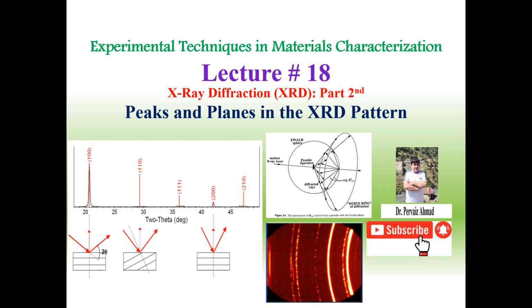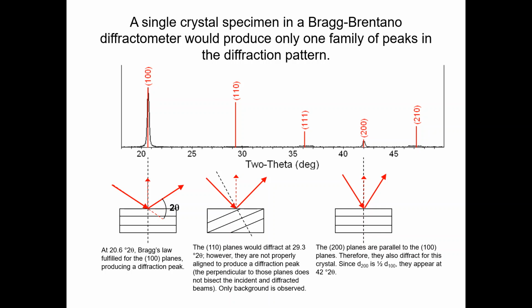Students, welcome to Experimental Techniques and Material Characterizations, lecture number 18. I'm Dr. Pervez Ahmed. This is the second part of the lectures on X-ray diffraction. In this part, we will discuss peaks, planes, and the XRD patterns. So let's proceed towards today's lecture.